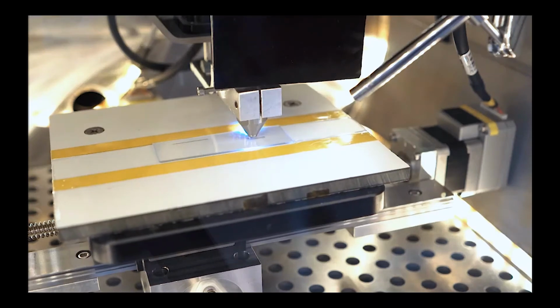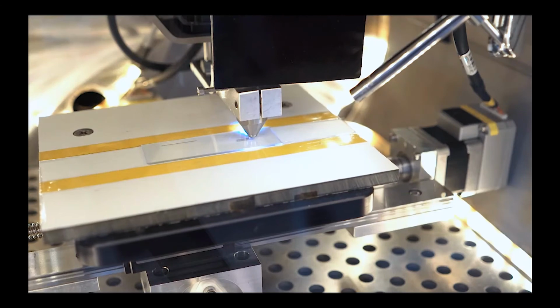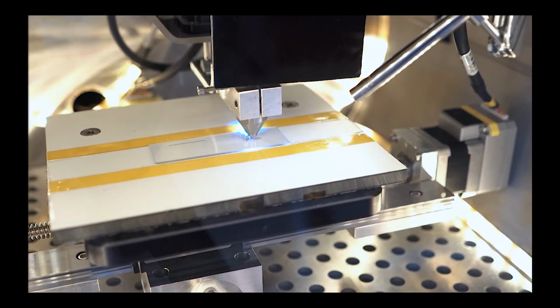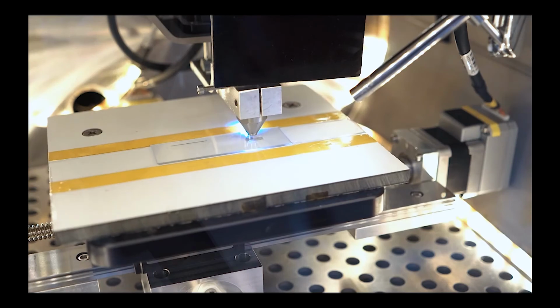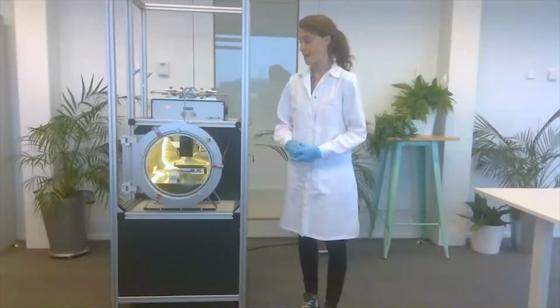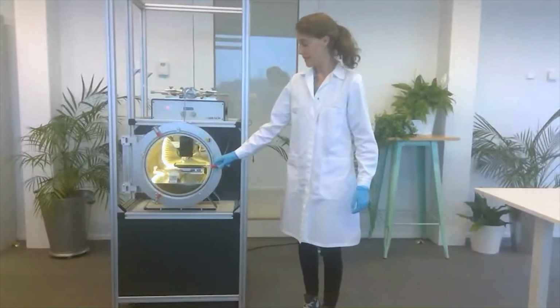And as I said, by changing the nozzle speed, you could change the layer thickness. And so you can vary various aspects of your pattern while printing. When it's done, I can again use the control software to shut down the system and flush the chamber so I can open it again and take out the sample.